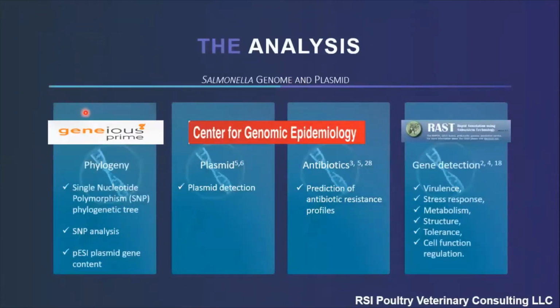The Geneious Prime software was used to build the single nucleotide polymorphism, or SNP, phylogenetic tree. It was also used to identify SNP carrying genes, or genes carrying mutations, and also to evaluate the plasmid gene content. The Center for Genomic Epidemiology online resources were used to detect the plasmids and to predict the antibiotic resistance profiles. The Rapid Annotation using Subsystem Technology online tool, RAST, was used to identify genes associated to various Salmonella cell functions.